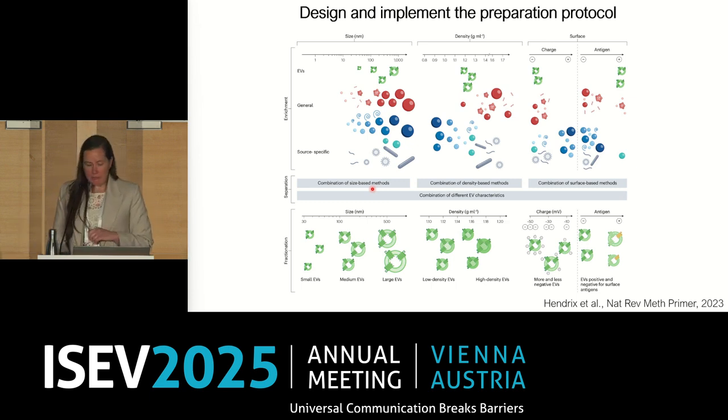But you also have to recognize that when you implement such a strategy, it will also result in the fractionation of extracellular vesicle subpopulations. We know from the morning session that EVs are very heterogeneous in their size. So if you apply a size-based method and you select particles based upon a particular size cutoff, you also have to recognize that you make a selection of EVs in terms of size and that you're studying a subpopulation of extracellular vesicles that have this particular size.